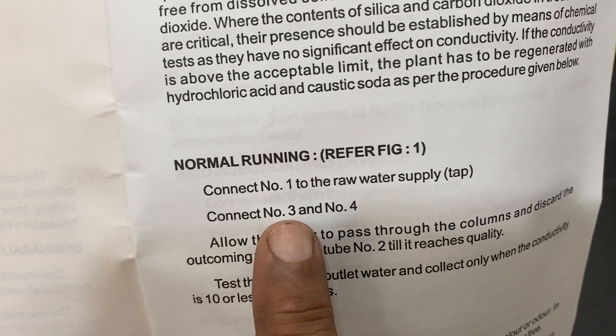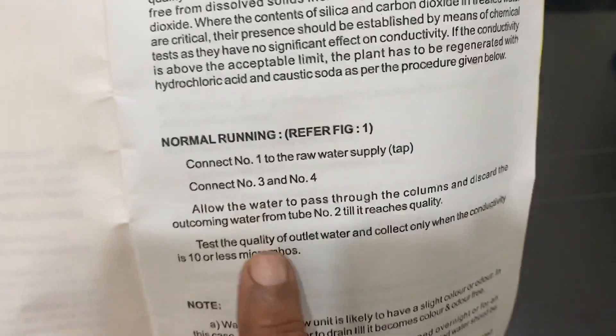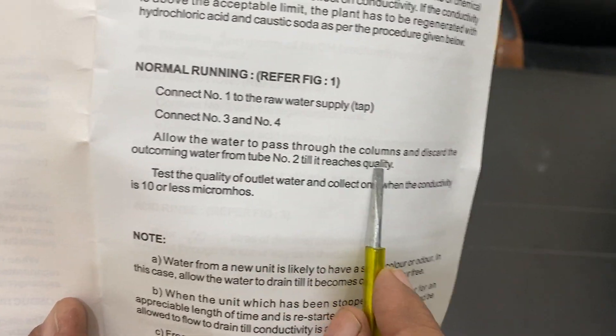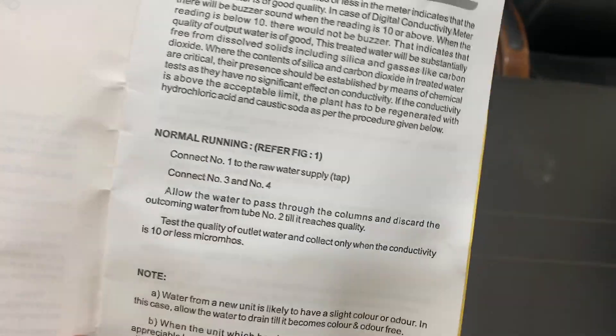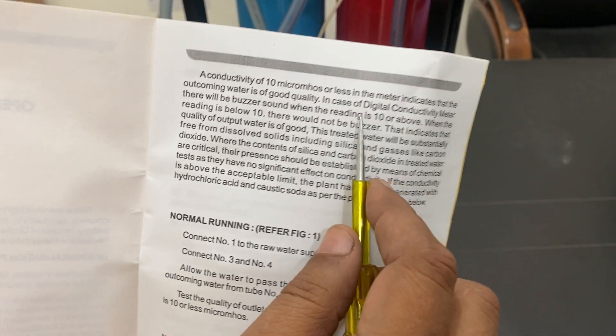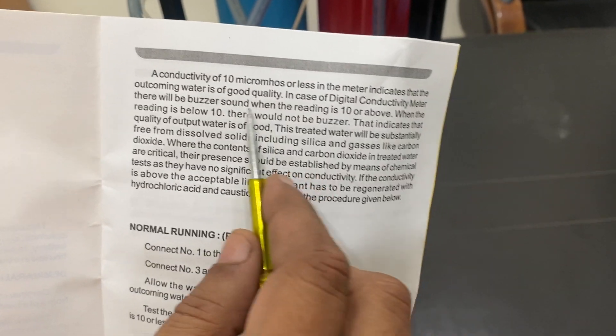Tubes three and four are automatically connected. Water will come out from tube number two until it reaches the required quality. When the conductivity reading is 10 or above, the water is not very good.